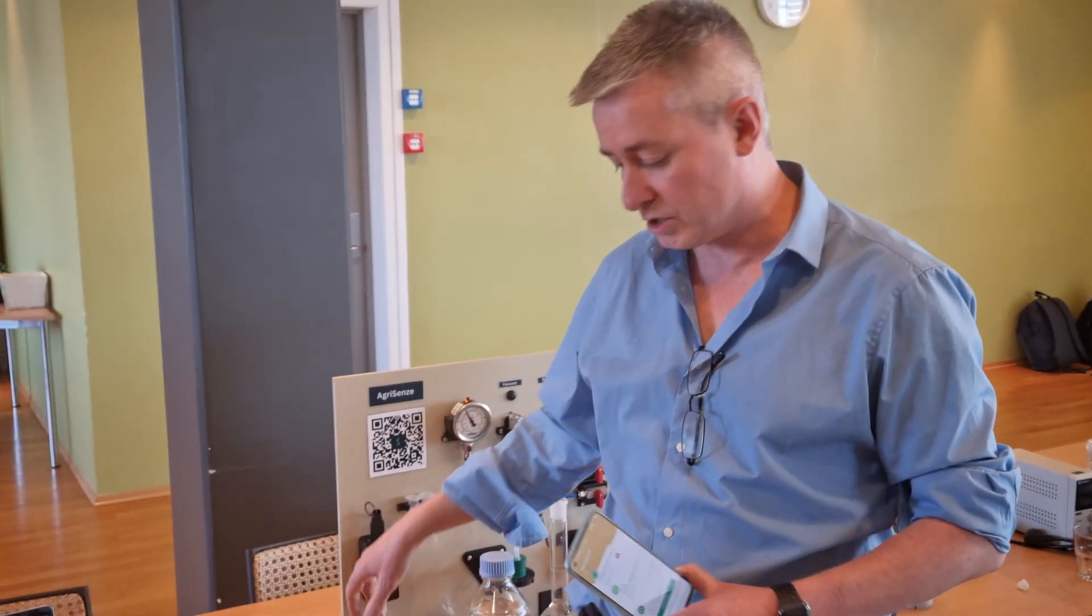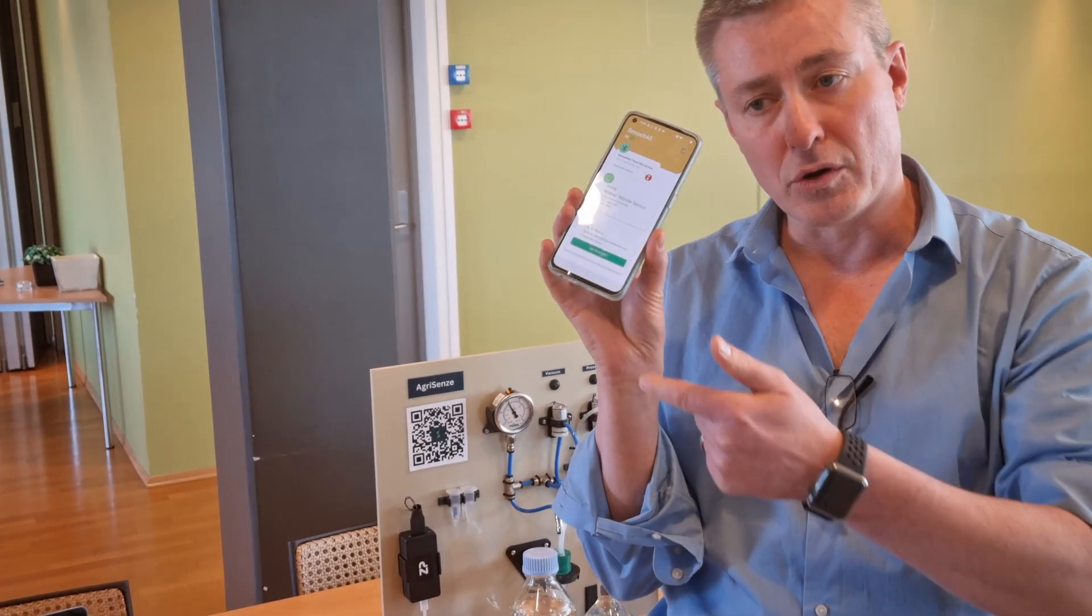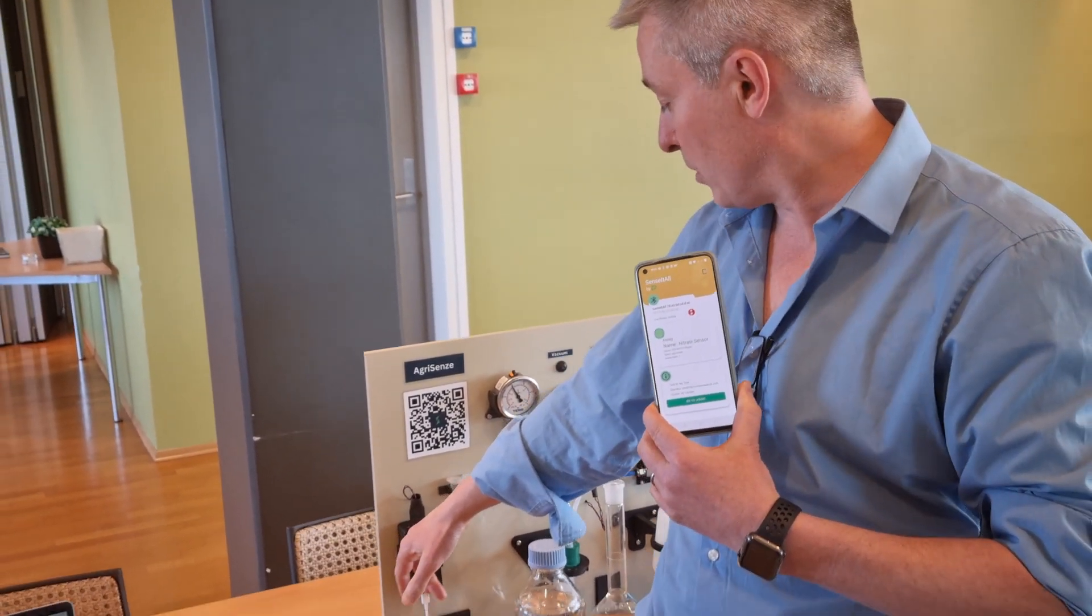We also have electronics here and what's really elegant is I have a phone that's actually a Bluetooth connection with this electronics here at the moment.